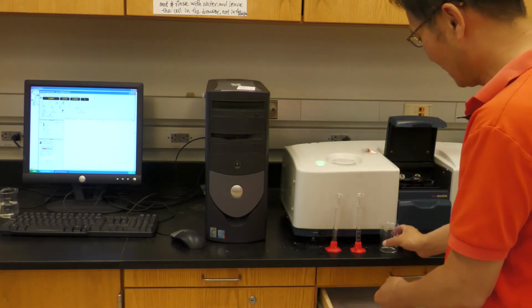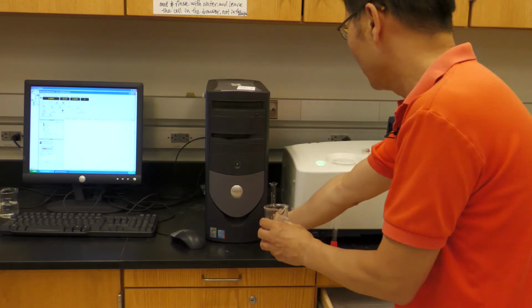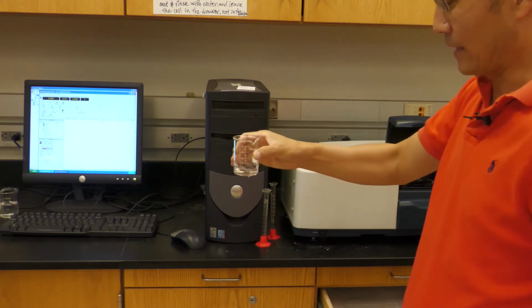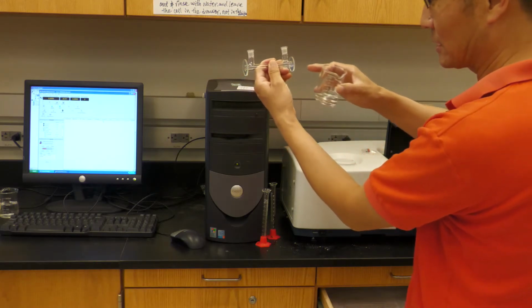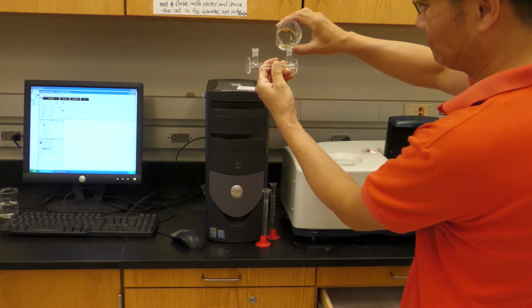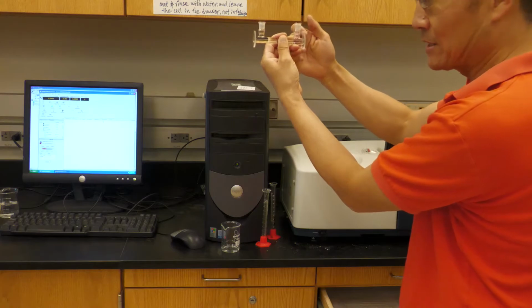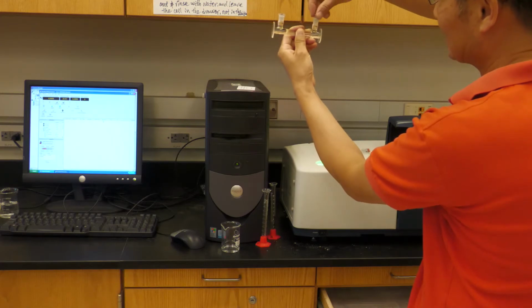Now the first step is you mix these two. So you just dump this one here. Then dump it here. Then shake for a while. Okay. Then add this one, hold the center, okay? Don't hold the side. So you add this one to your cell. You need to add this all the way up to these two stages to make sure this one is completely filled, okay? Then here are two leads.